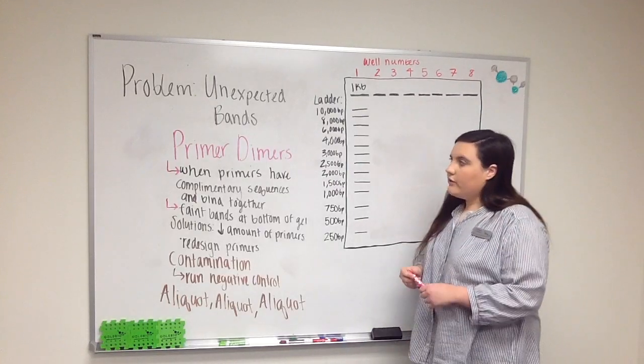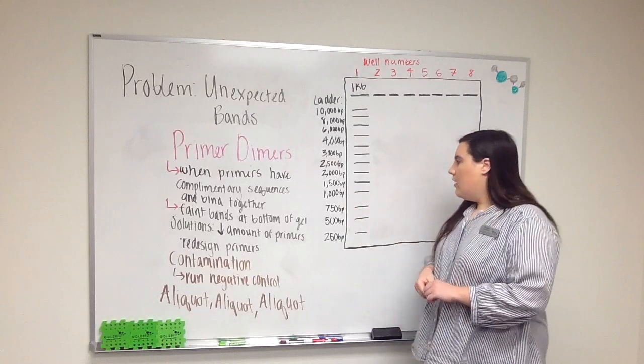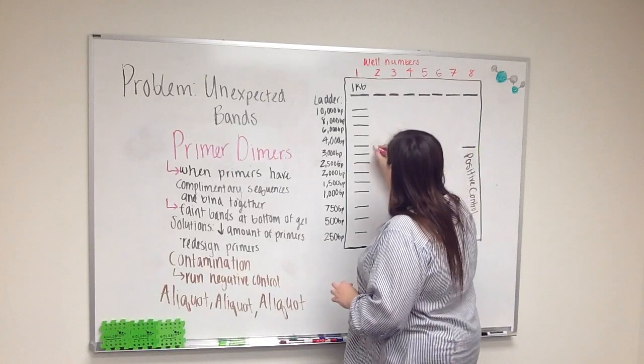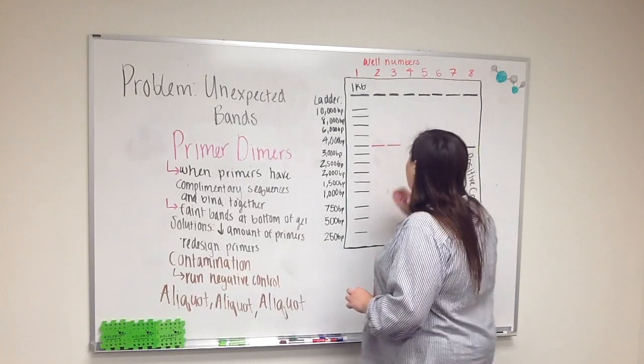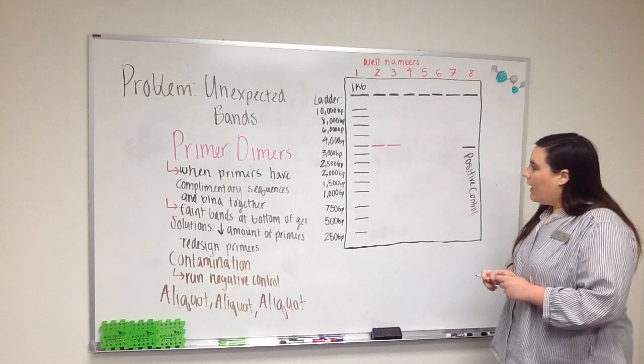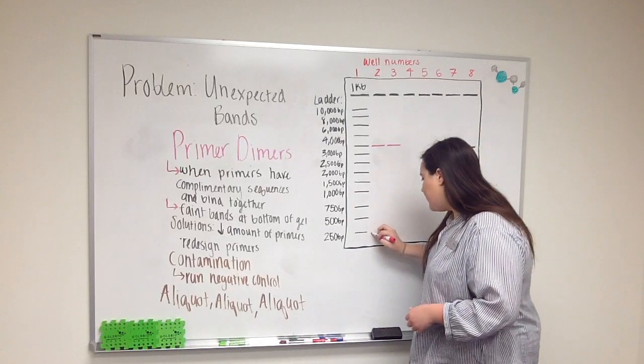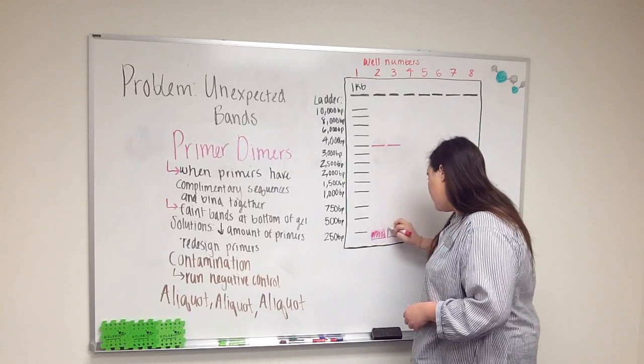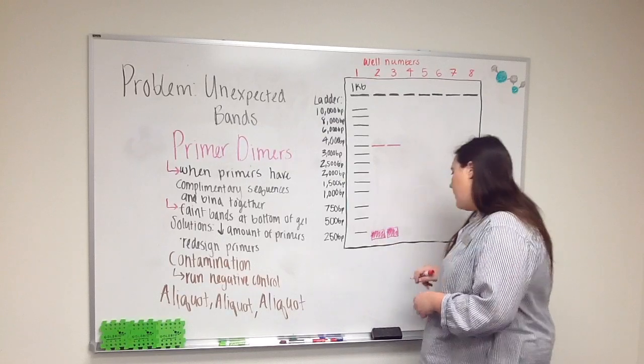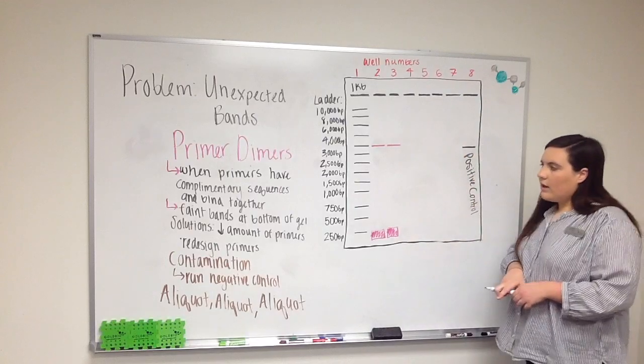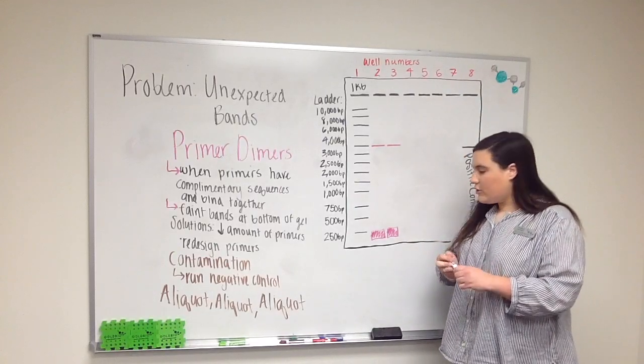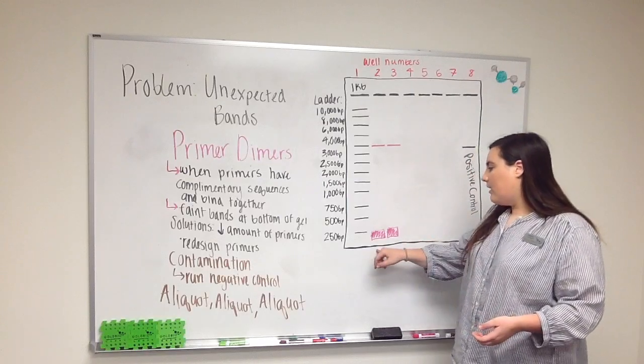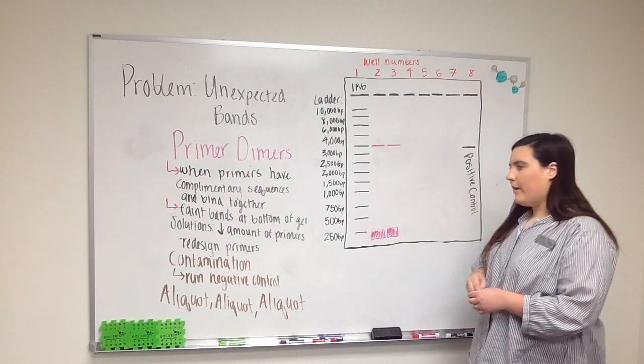So the first issue I'm going to be discussing is primer dimers. What primer dimers appear as on your gel is that you'll have your expected band, draw it in lanes 2 and 3, and you'll also have a small band at the bottom that's very faint.